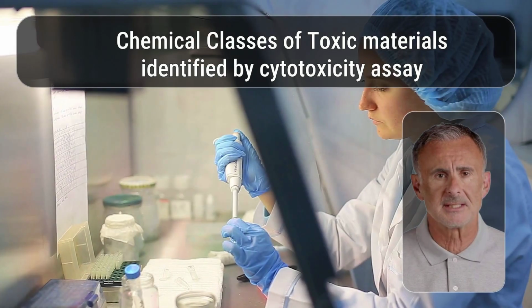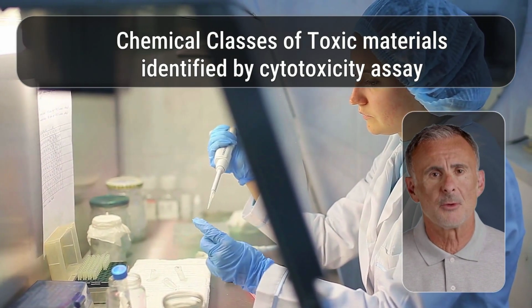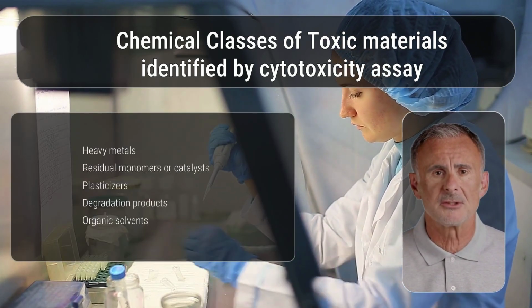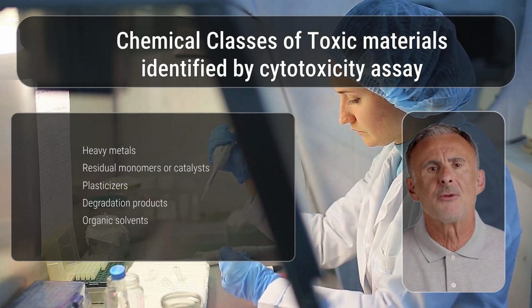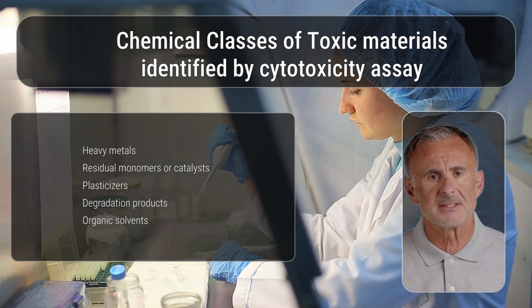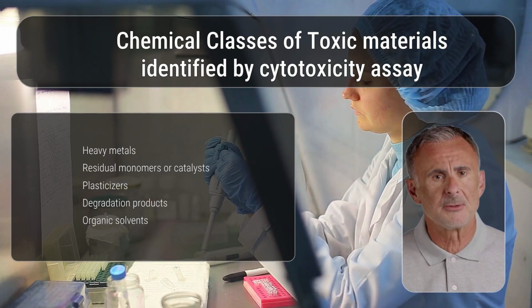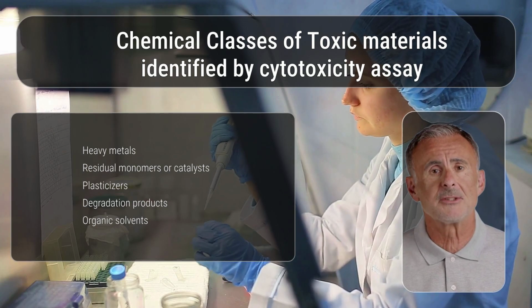While cytotoxicity tests do not directly identify the chemical, they detect the effect of a broad range of potential toxicants, such as heavy metals like lead, cadmium, nickel, leaching from alloys or pigments, residual monomers or catalysts from polymers such as formaldehyde, acrylates, plasticizers such as phthalates or stabilizers, degradation products from sterilization or aging such as peroxides, acids, or organic solvents remaining from manufacturing.